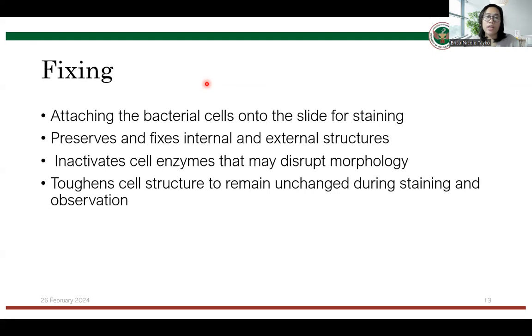It is important that the smear is not subjected to heat in order to preserve the structure or morphology of the cells, because the fixing step may contribute to the shrinking of the cell. There are changes in the natural morphology. So sometimes fixing is not employed.